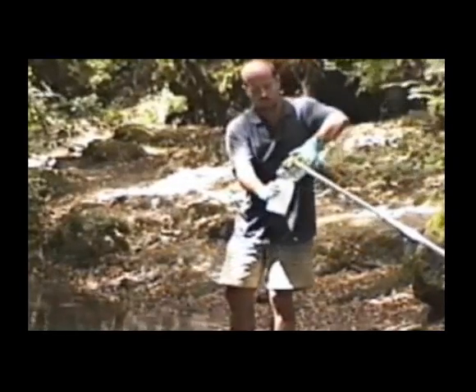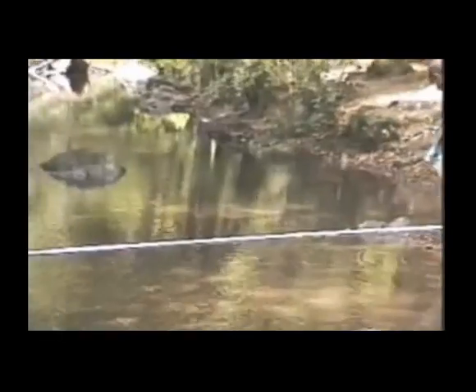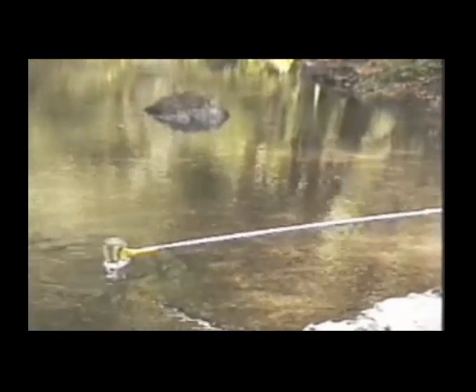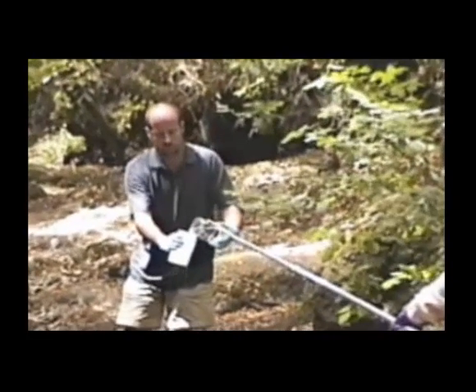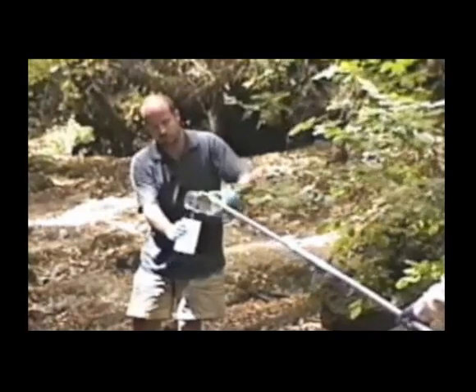Again, the sample container is agitated, and now the sampler reaches out into the centroid of flow with the extendable wand and takes the sample back to the person with the sample container. They then decant the sample into the sample container.